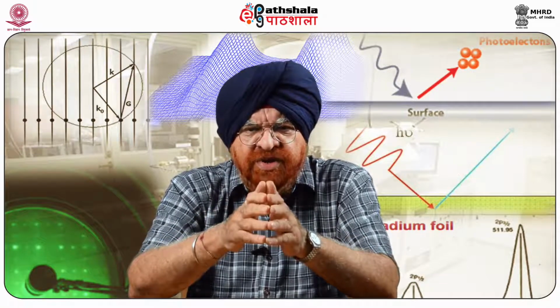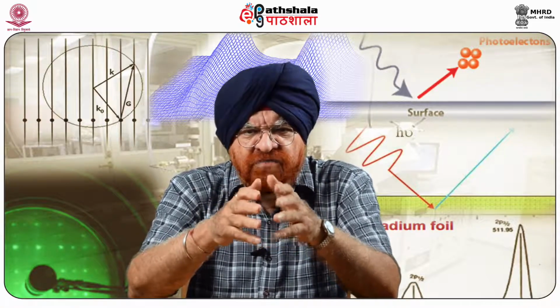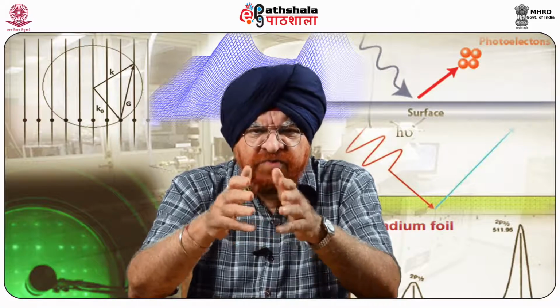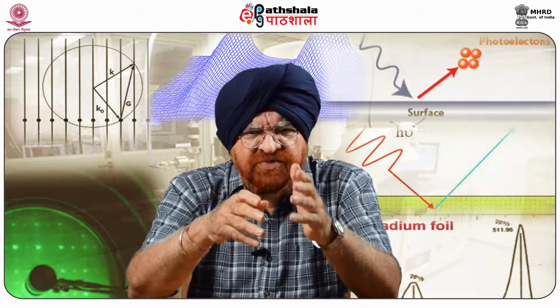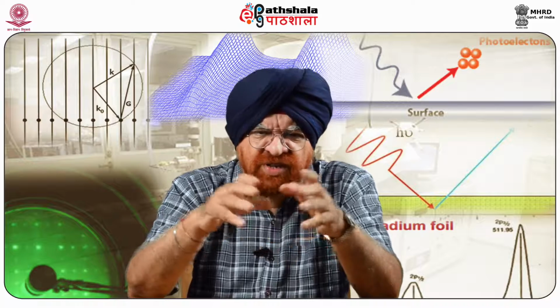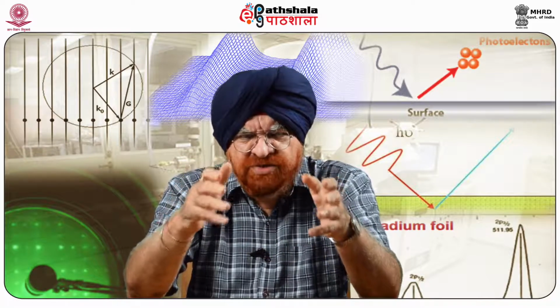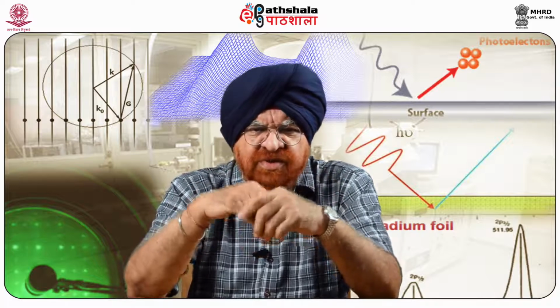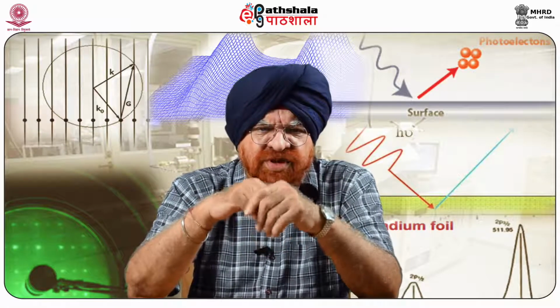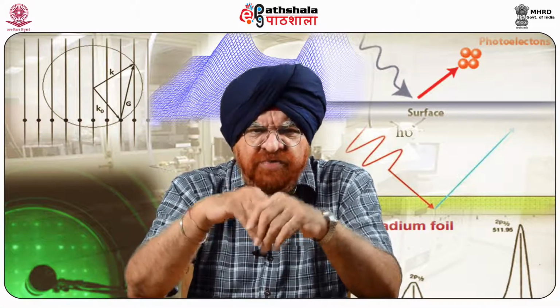External and internal vibrations from fans, pumps, machinery, building movements, etc. are a big problem. A slight disturbance when you are using STM in the building would alter the results, and you will never get these sharp images. That is why we always use anti-vibration tables while carrying out studies with this. UHV and STM is not easy to build and handle. That always remains a problem with very sophisticated equipment.